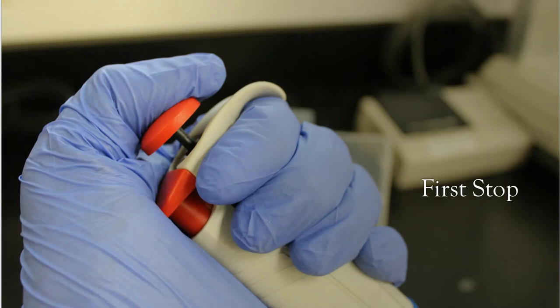Then I'm going to stick the tip into the solution, and then I'm going to slowly release the plunger. And again, that's something that people do not do. They just pop it right off. And every time I see somebody do that, I just cringe, because this can ruin a micropipetter. It can shoot your liquid up into the tip. That liquid can go up into the mechanics of the micropipetter, and if that organic starts to react with the gears and all of the other things inside of the micropipetter, you have just ruined a $400, $500, $600 micropipetter because you did not listen to me and go slow with releasing that plunger.